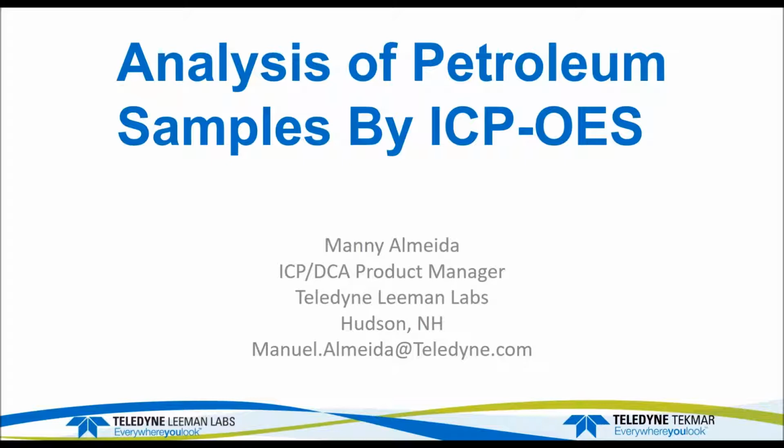Thanks, Shelley. Good morning, everybody. Thanks for taking some time out to attend the webinar. So the subject today is we're going to look at the analysis of petroleum samples or petroleum type samples by ICP OES.